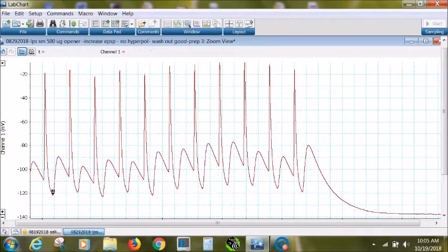and then you are going to go to the 25th evoked response, which is down here. We'll place this in this valley, and then move the cursor to the top of this one, and then you'll write down the 39 in your file.